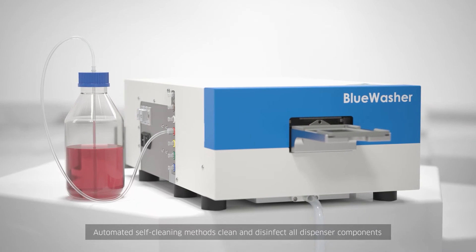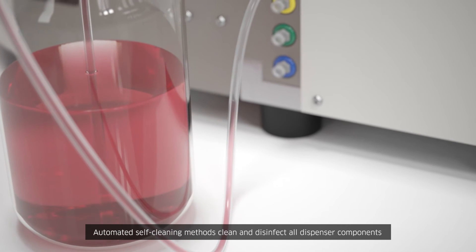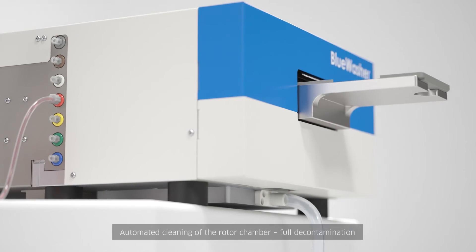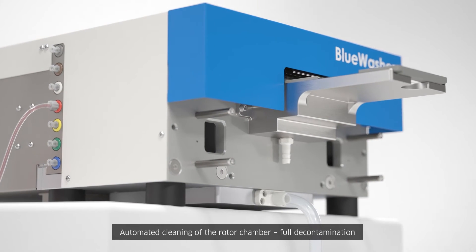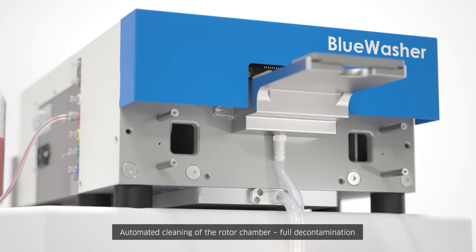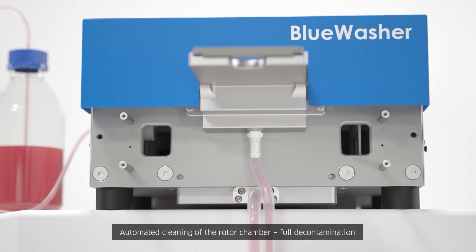The internal rotor chamber and all dispenser components, shared and dedicated, are automatically cleaned and disinfected using Blue Washer's patent-pending self-cleaning methods. Blue Washer's submersive drum clean method reliably removes any build-up deposits from inside the rotor chamber for intense decontamination.